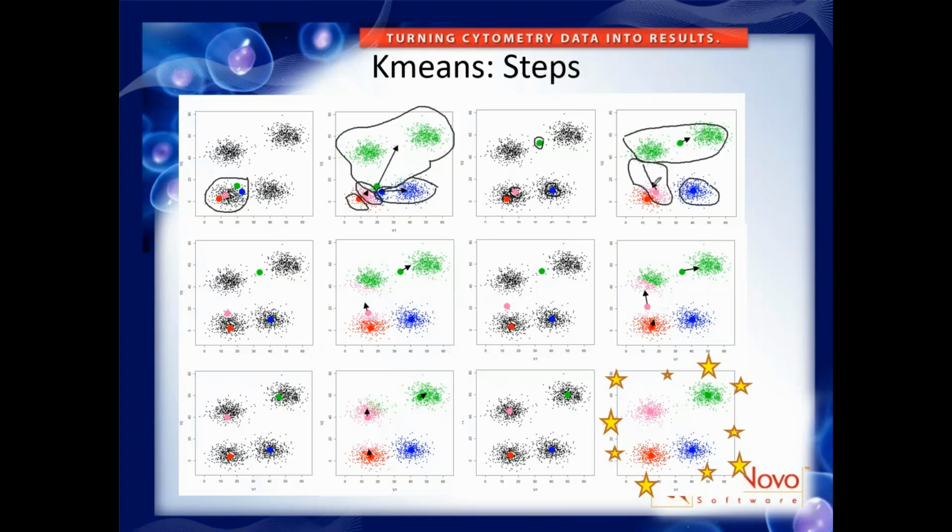So they're closer to here than they are to here. And so they got assigned to the pink cluster. And then of course we got a red cluster. And so what happened is those few cells being assigned to the pink cluster pushed, when you calculate the new average position, the pink cluster a little bit up.